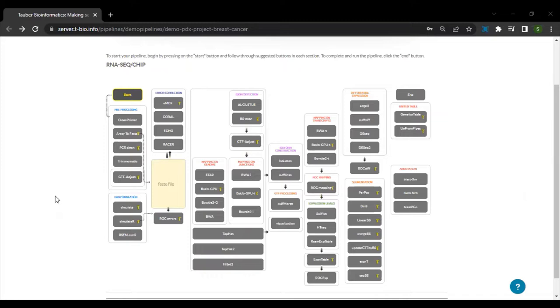Note that in this demo pipeline, we are making use of samples that were taken from humanized mice with implanted tumors, and it consists of two breast cancer subtypes: estrogen receptor positive and triple negative.